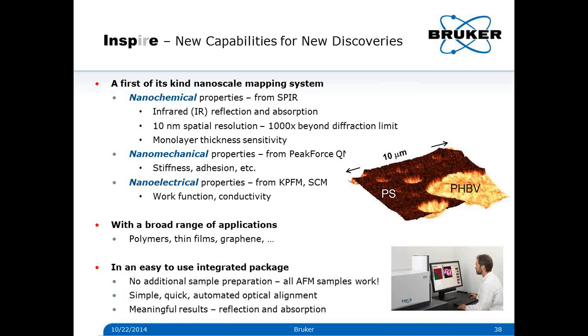I assume that would be a gold nanoparticle. Then you would have high reflection, and it also depends a little bit on the size of the particle. But I would assume that you can measure this with the SNOM technique. It depends a little bit on the depth of your nanoparticle.